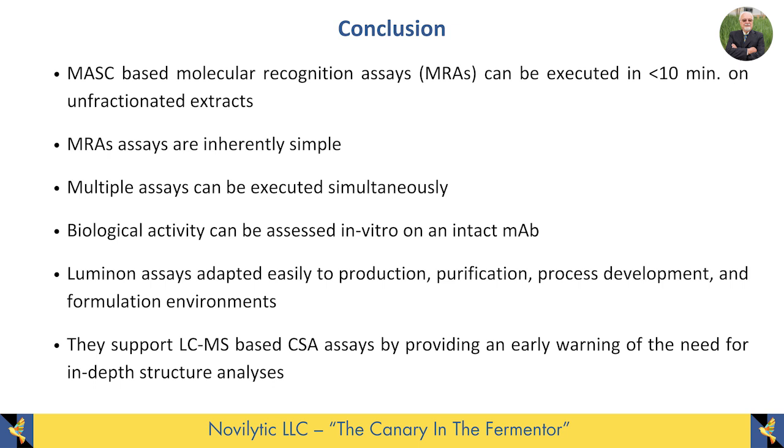Is that something that we predicted, or is this an entirely unknown thing? And for example, what this does, it's very interesting, is that there are sometimes mistakes that happen that are not predictable. In other words, you don't know what you don't know. And so you can do unpredictable things like people making a physical mistake in the order in which they do things and so forth. So it's very important that you have a test that shows you that the unexpected happened. And the unexpected is that the molecule doesn't work. And so that's why it's so important that you have tests that determine whether a molecule works or not.